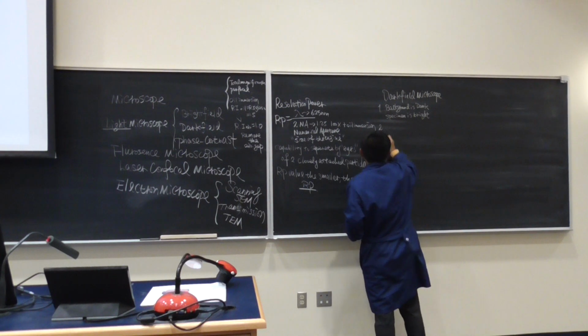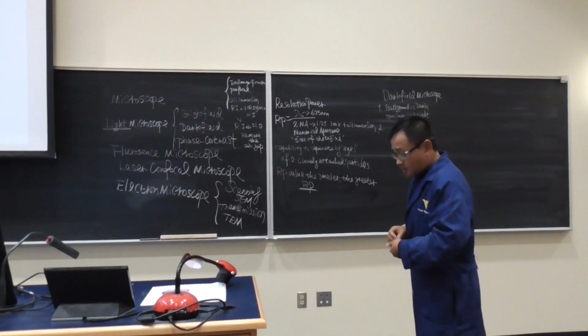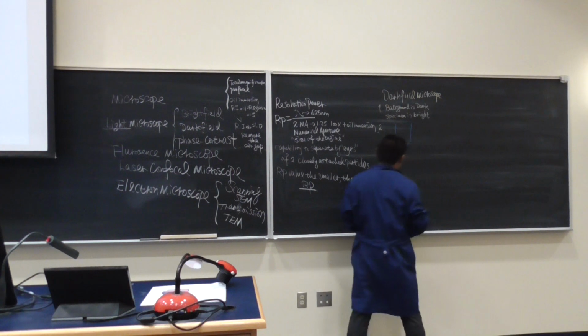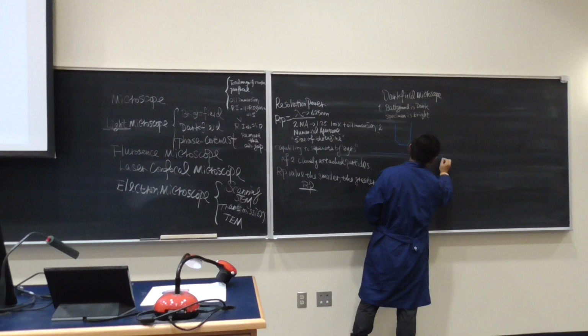That's the first thing. Second, why can it look like that? Because the structure is a little bit different. Here is a microscope objective lens. Okay, we draw it briefly. And then we have a stage. Here is the stage.